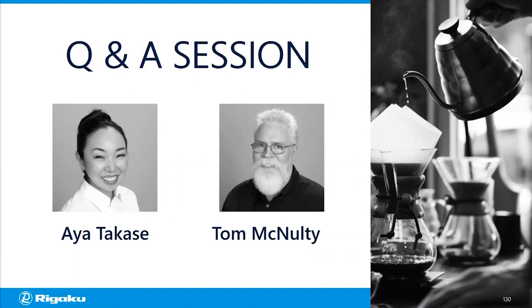That's a good question. Not easily. You have to have the reconstructed volume to index the grains. The only reason I said not really is that it's kind of possible, but probably doesn't work very well, meaning you can do a real-time reconstruction by using limited projections to get a limited volume reconstruction, and you can start indexing them. But indexing those grains is not an easy analysis, so you might not get really good results until the scan finishes and you get a high-quality reconstructed volume.